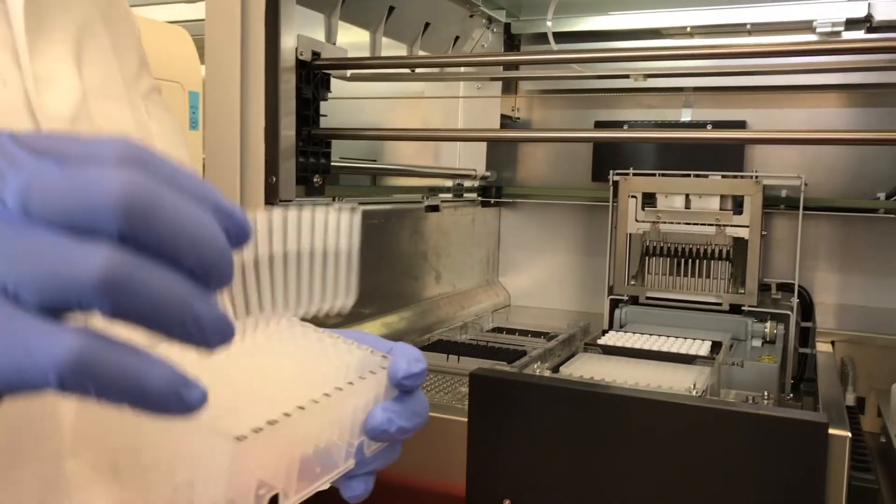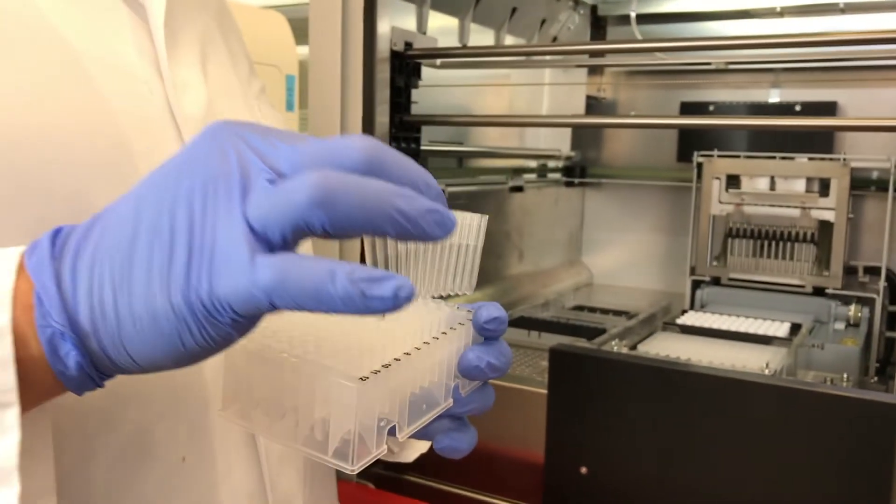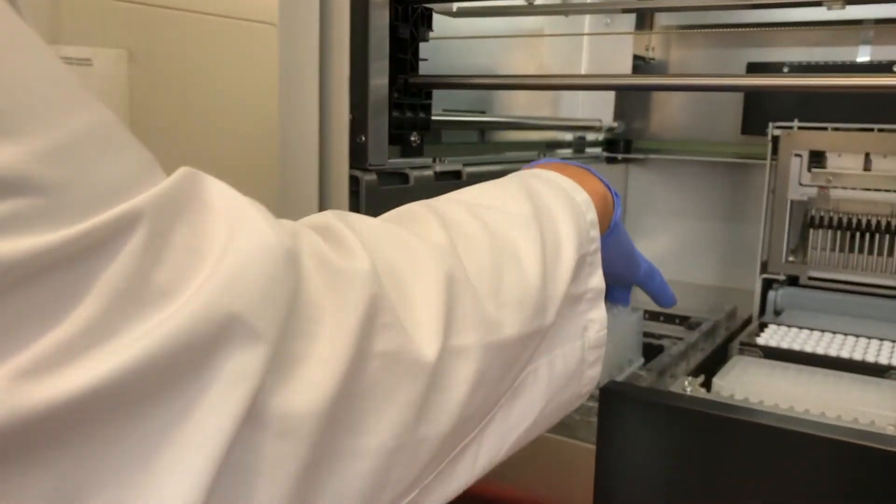Alternatively, an eluate plate with 12 strips can be used as a destination vessel for purified nucleic acids.